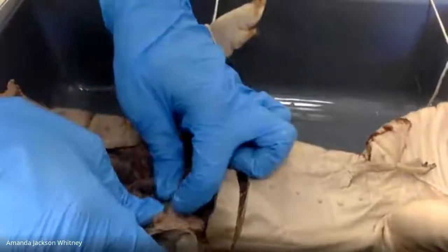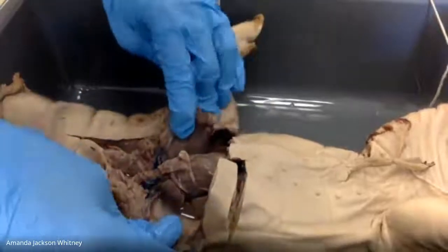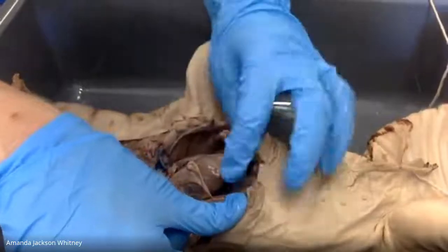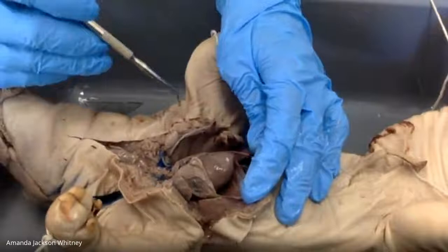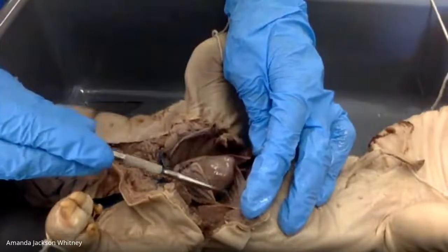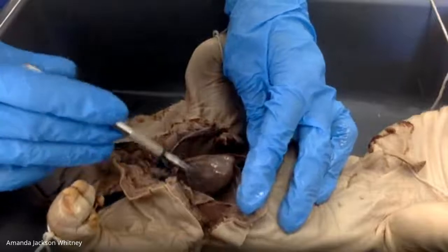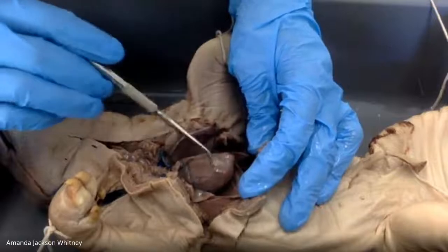Okay. So a lot of tissues surrounding these organs here in the thoracic cavity. So you can kind of see these tissues like right here, the pericardium. This is surrounding the heart. There's also a layer of tissue that's directly on top of the heart.